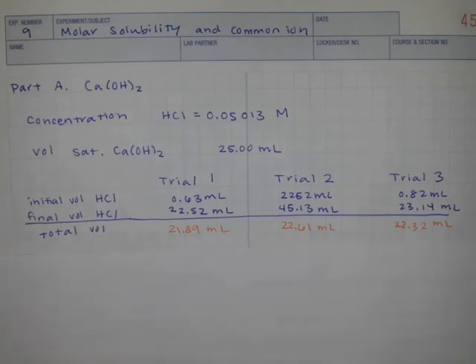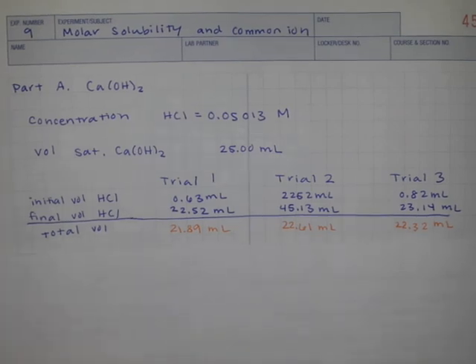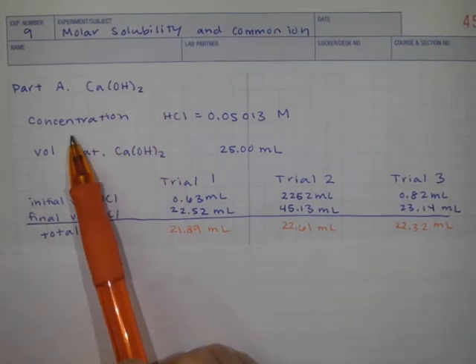Hello, this is the tutorial for experiment 9, molar solubility and common ion. So you did a titration with saturated calcium hydroxide using HCl.